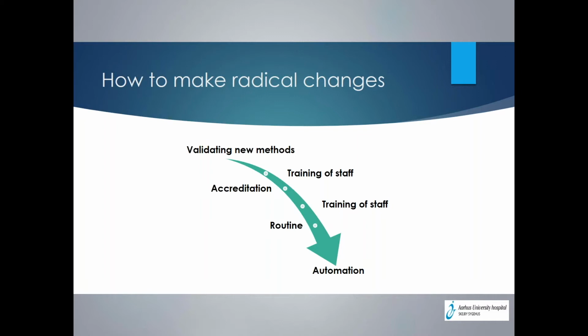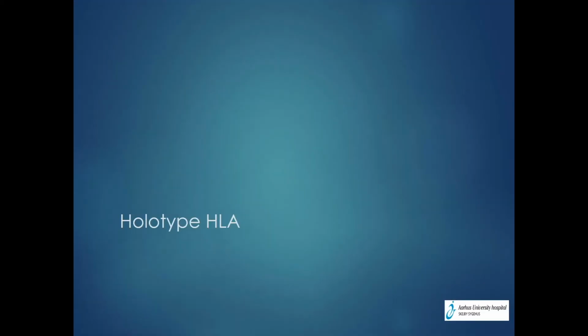But before choosing automation, I think it's really important to get the feel of a technique in hand, and we have done so. Going from all those different techniques to a very, very different kind of technique is a rather difficult task, in the sense that you need to validate all the new methods you want to implement. To validate them, you need to train the staff while doing so, and when you're ready, you of course need to have those new methods accredited. At that point, you will often not have trained all the staff that you have in the lab, so there's still some training left before you really go into routine, and this was what happened in our lab.